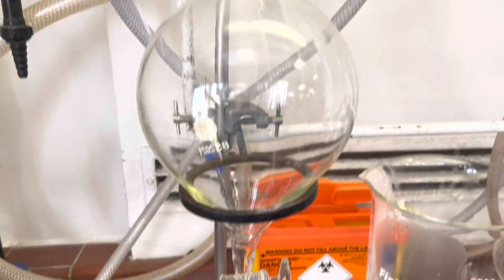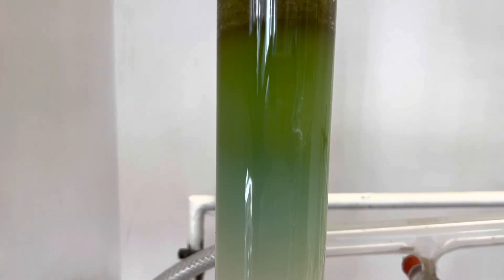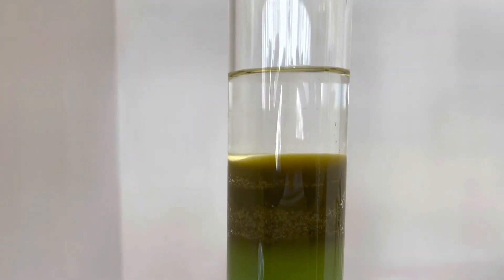I've been doing a VLC — a vacuum liquid chromatography — of more of the extract. You would have seen a few vlogs ago I spent my Saturday doing a very nice and colorful column, and I'm doing it again on the other half of the extract because it worked so well. I did that this morning and I'm an expert at this column now, so I managed to do it in a few hours. Everything went swimmingly, I'm very very pleased.